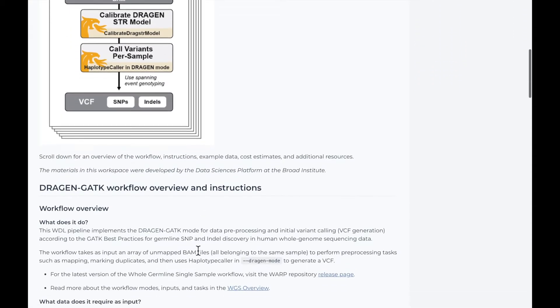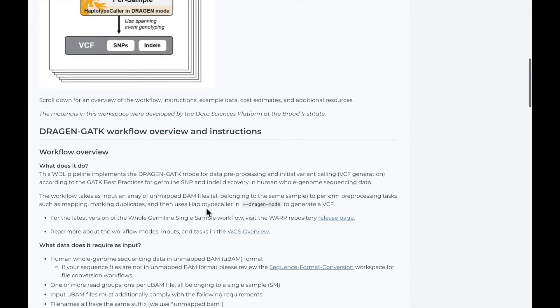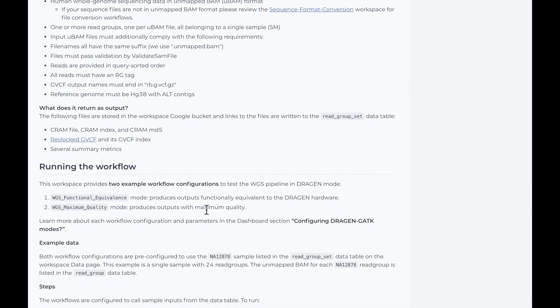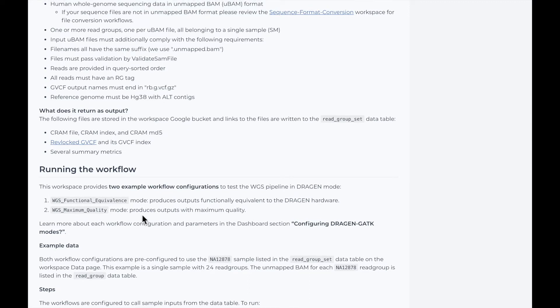In the workspace dashboard, you can find descriptions and instructions for the two example Dragon GATK workflow configurations. The functional equivalence configuration produces results functionally equivalent to the Dragon hardware, and the maximum quality configuration performs additional steps like unmapping contaminant reads and using spanning event genotyping. Today I'll show you how to run the functional equivalence workflow, but the steps are similar for both configurations.